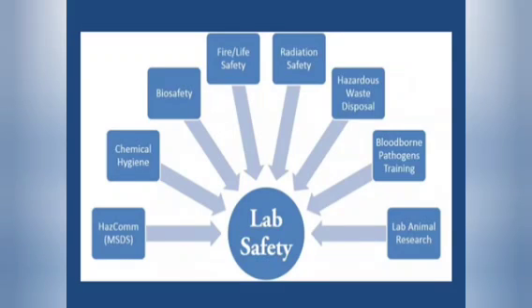This picturizes the various safety issues that must be considered when we talk about laboratory safety.